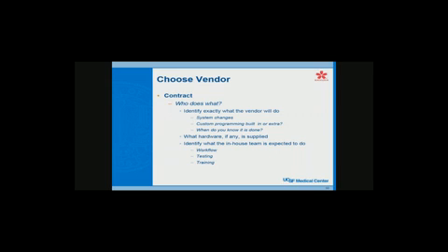When you finally choose a vendor, you're going to write up a contract. And basically, a contract is saying who does what. So you need to be sure it's identified and that you understand exactly what the vendor's going to do, what kind of system changes they're going to make, whether you'll need custom programming, and you allow some leeway for custom programming because it probably will come up. And then really, how do you know when they're done? How do you know when the system is finished? Is it the day you go live or is it 2 weeks later? Those are the things you have to figure out in the contract.